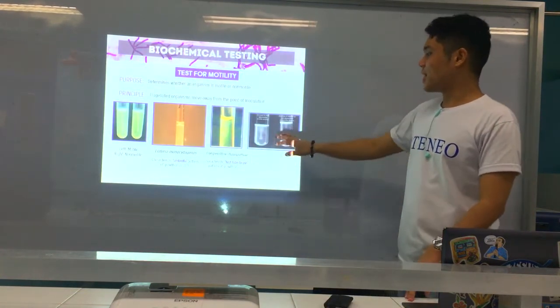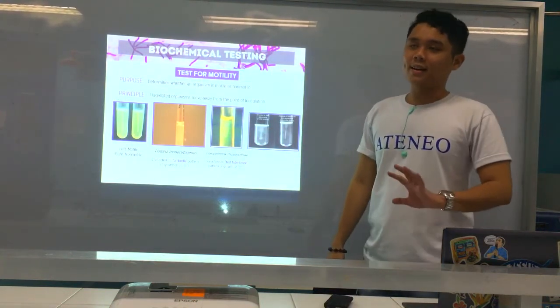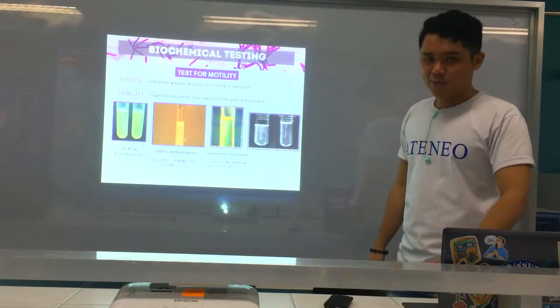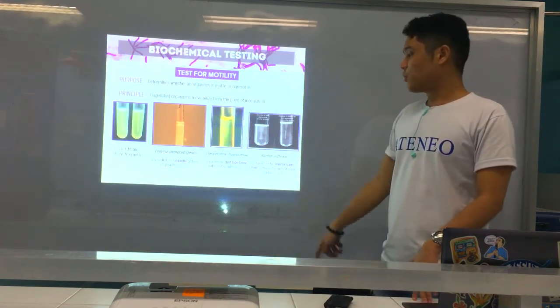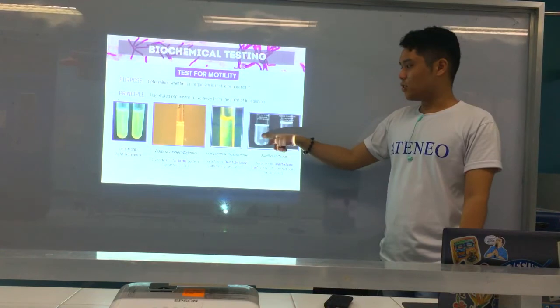And lastly, Bacillus anthracis, this one. Again, Bacillus anthracis is non-motile. Most of the strains are non-motile, but there are some motile strains. And if they are inoculated in a semi-solid medium, it's described as an inverted pine tree appearance. Bacillus anthracis, okay? As you can see.